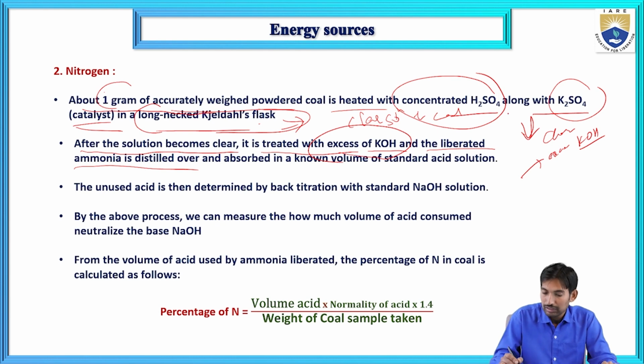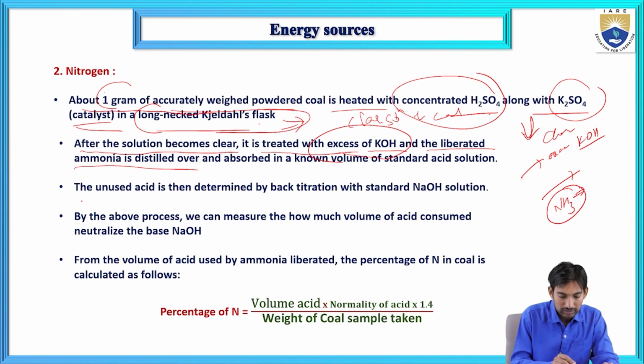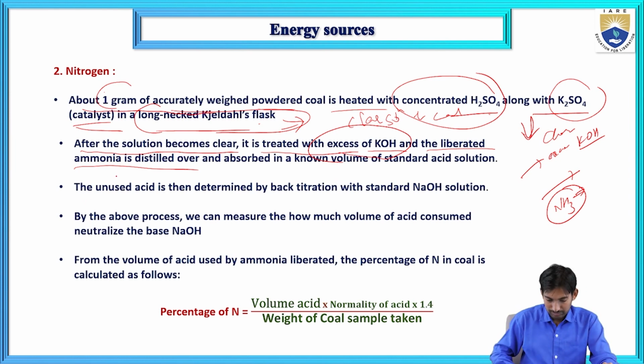The clear solution reacts with potassium hydroxide and forms ammonia gas. Then we send this ammonia gas into a known standard volume of H2SO4 of known concentration of acid.